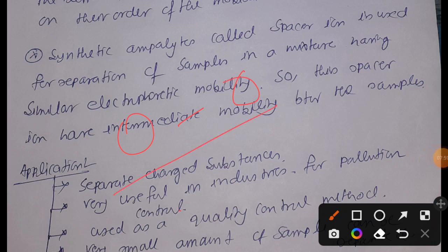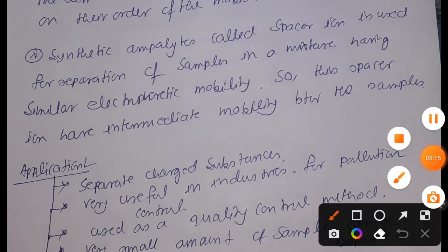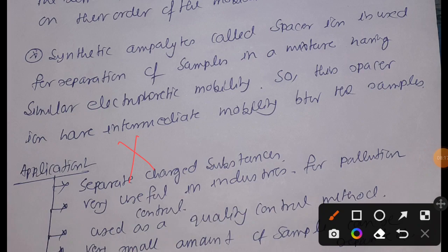So what we have to do, we have to break the tiebreaker. So we will play extra time, and after that extra time we will move on to a tiebreaker to distinguish the winner, right? So simply in case of our isotachophoresis, if the X sample ion that we are using has a minor difference with the electrophoretic mobility of Y, then isotachophoresis will not solve our problem. Okay, so we need something more.